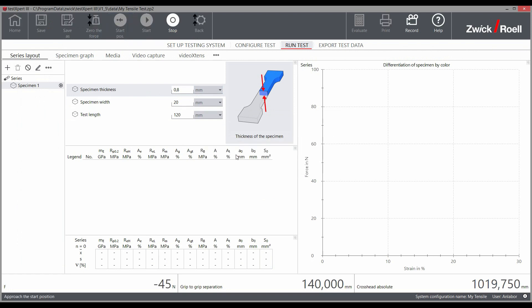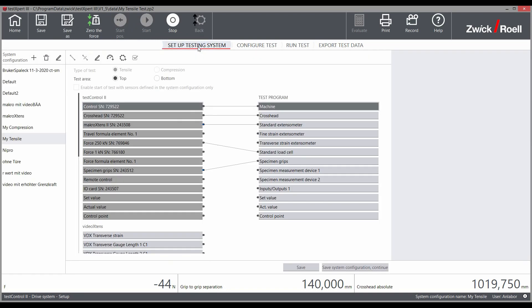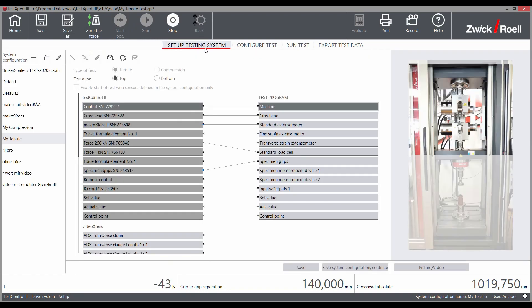All relevant testing system and safety settings, such as crosshead position, tool separation, and sensor configuration, are defined once and saved in a system configuration in TestExpert 3.